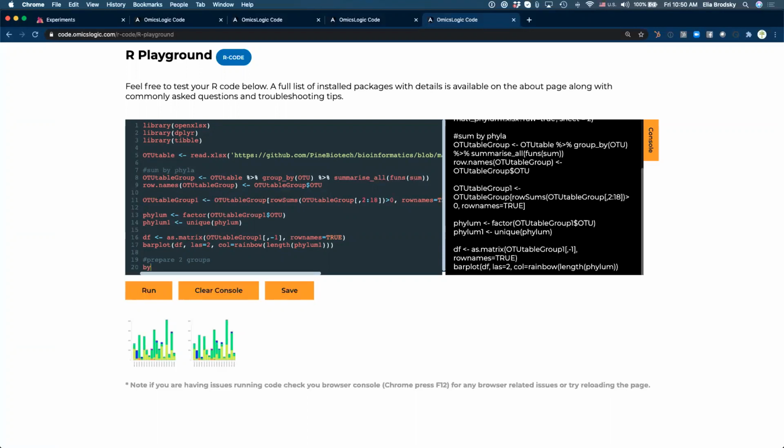So let's make one group by group rarely, the exercise rarely. And we'll say as matrix, and we will take row means, right? Because we want to take the mean of all of our phyla between samples, and we'll take OTU table group 1.